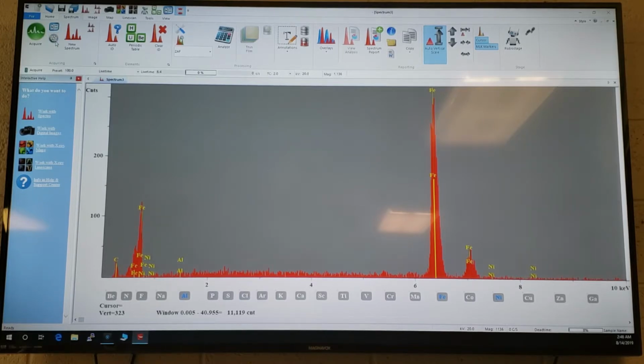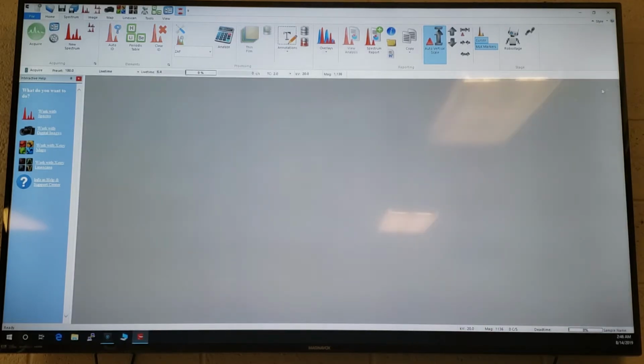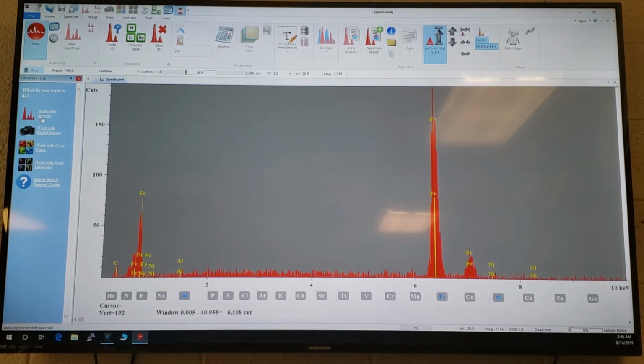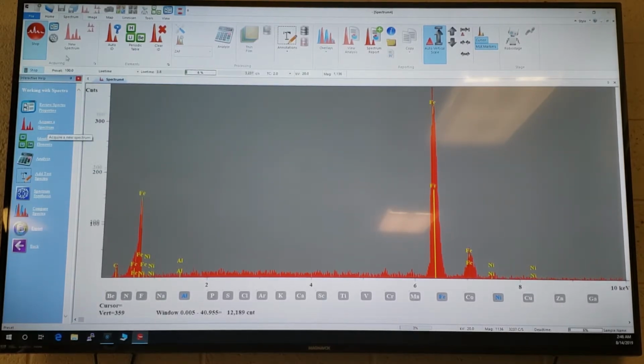Here's some settings for our EDS, right? Who cares? And this is just properties, right? We got the properties using the pull downs as well. Acquiring a spectra again. So before we used our flowchart system to acquire the spectra, now what we just did, we just hit acquire. So this is the XRF panel, we don't have it.